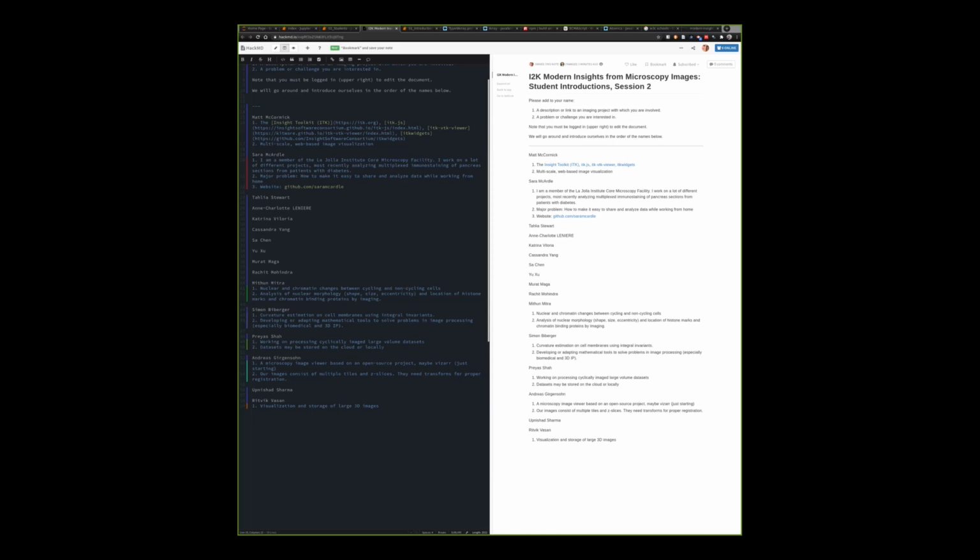But we want to continue that and do some imaging of the nucleus, to study nuclear size, shape, morphology, and also image a lot of histone marks, so let's get the distribution pattern. We started doing some confocal, and we want to do more super resolution microscopy. I'm also mentoring a lot of students. They are not here, of course, they're at their homes because the quarter is online. So these web-based technologies will be useful because they can use them from their homes. So that's another.